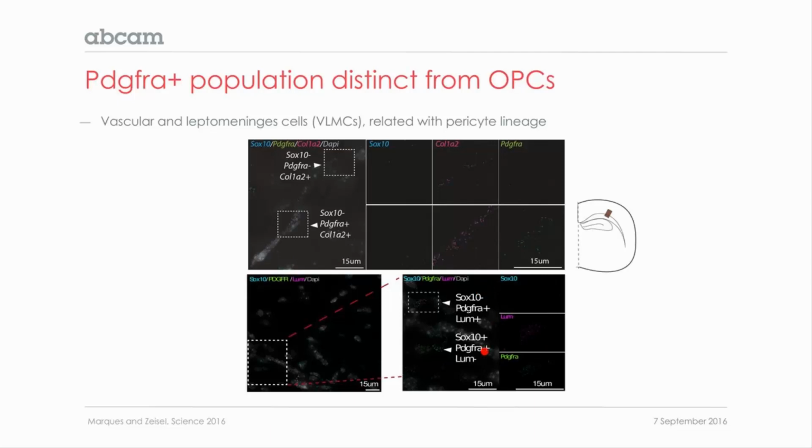These cells also presented some specific markers that are not in the pericyte lineage, like LUM, as you can see here in this single molecule FISH, which was performed by Simone Kudeleppi in Sten Linnarsson's lab.